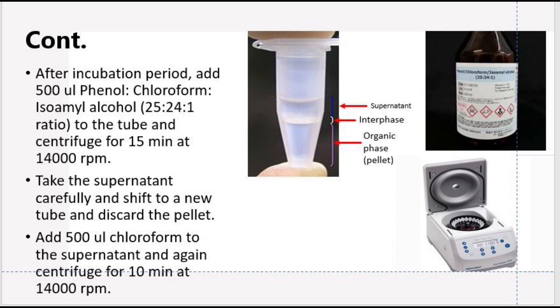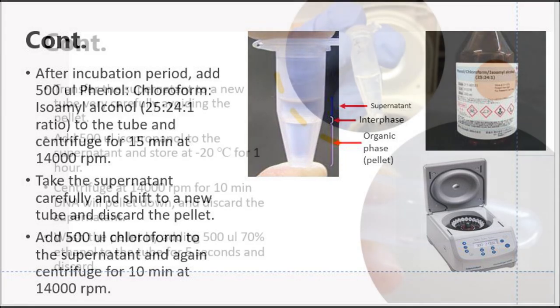Then add 500 microliter chloroform to the eppendorf tube and centrifuge it for 10 minutes at 14,000 rpm. Now we will have two phases: the upper phase that is supernatant that contains DNA, and below is the organic phase.